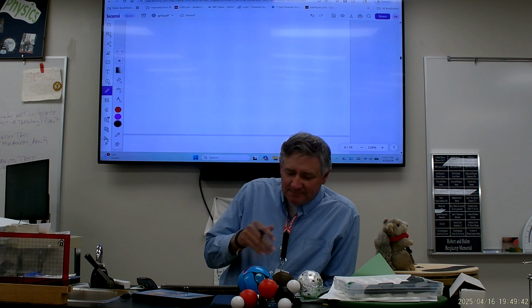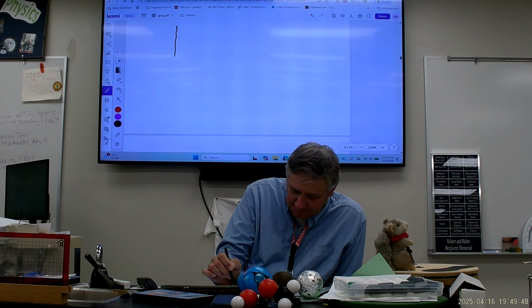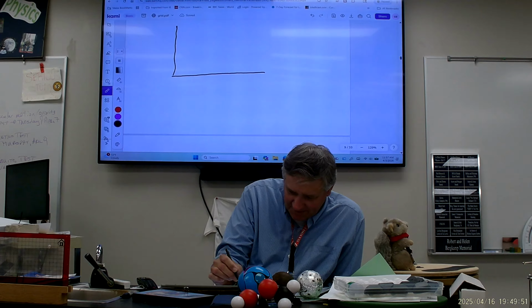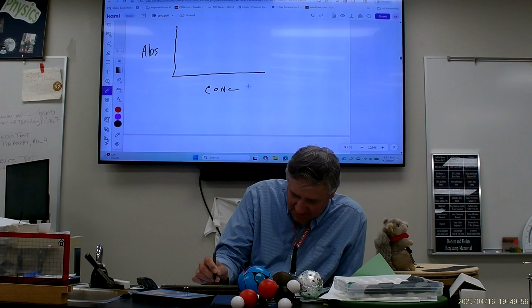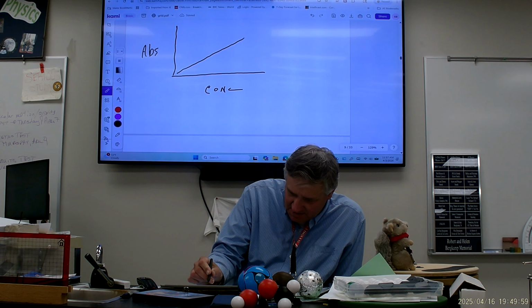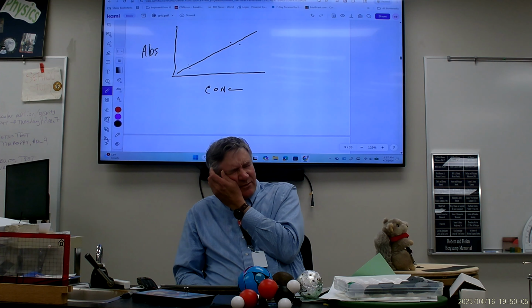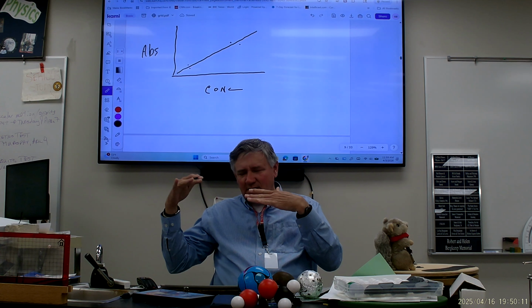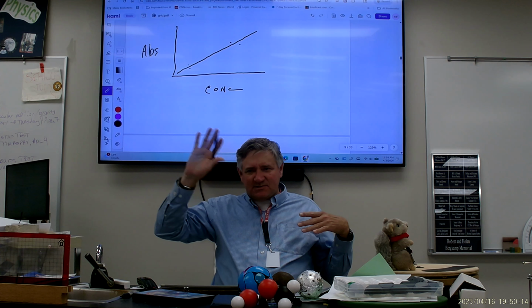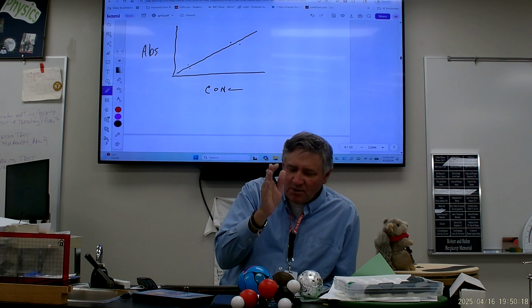Good luck. Okay. So let's chit chat about the lab. Hopefully by now you have a graph where you have graphed absorbance on the y-axis and concentration on the x-axis, which hopefully is pretty linear. I looked at your data, and for some of you that first stock solution's absorbance didn't fit the trend. Don't be afraid to throw that one out, because the other ones all fit that pattern. So don't worry about that.